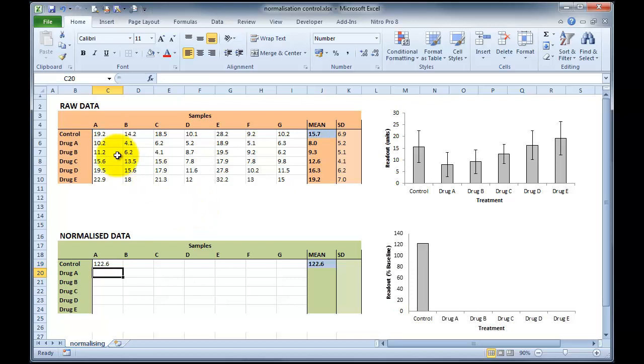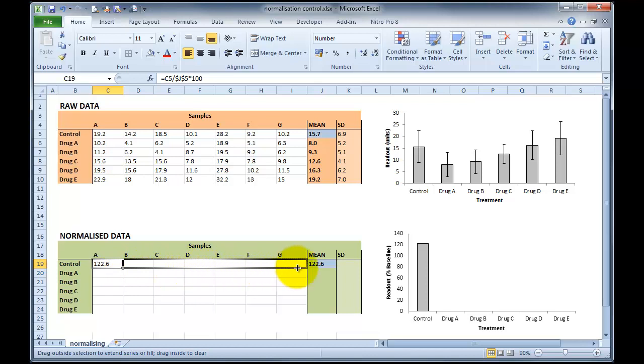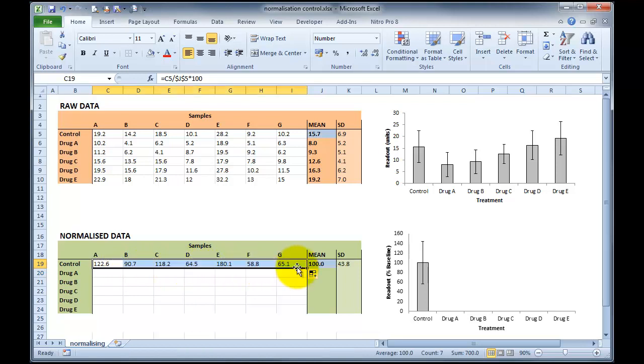And you can see that in fact sample number A is 19.2, which is higher than 15.7, therefore it's 122% of baseline. However, if I now click on this little dot on the right-hand side and drag this across all of our control values, our mean percentage is in fact 100, because it's a 15.7 average normalised to itself, which is correct.